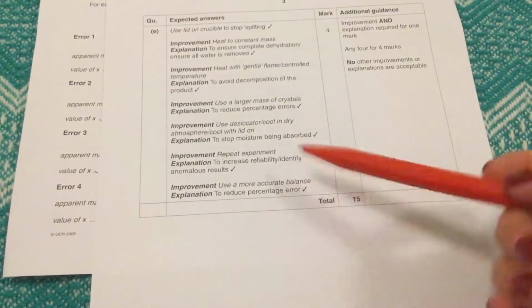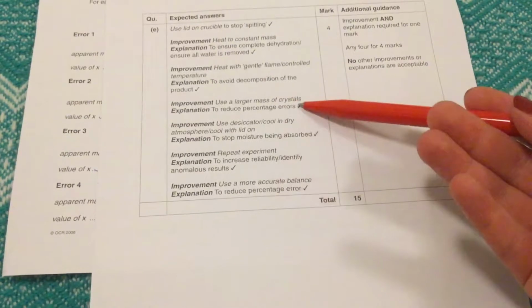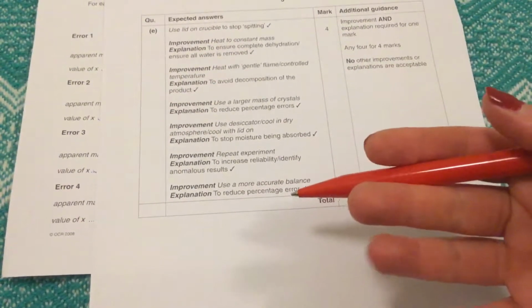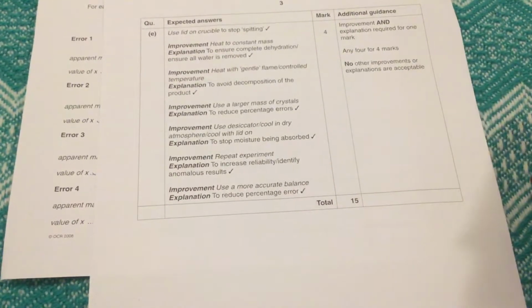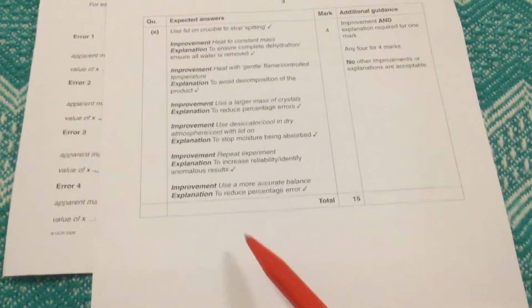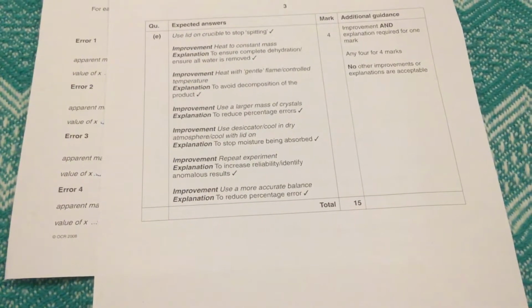And use a more accurate balance, which kind of links in with this improvement here. It's a similar sort of thing in that we are trying to reduce the percentage error. So a more accurate balance, one that has got a greater number of decimal places on it, would help also to reduce the percentage error because there would be less uncertainty involved in that.